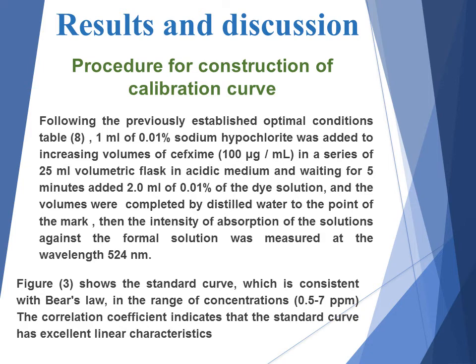Then the intensity of the absorption of the solutions against the blank solution was measured at the wavelength of 524 nanometer as shown in figure 3.